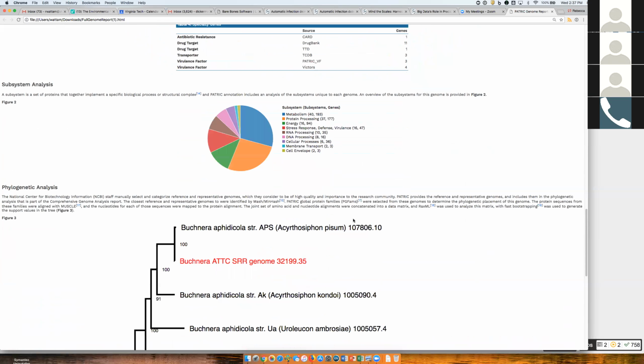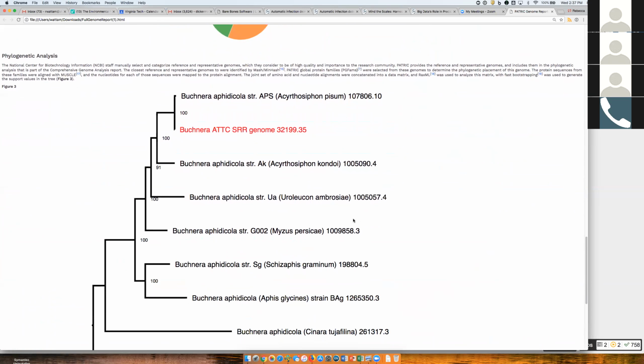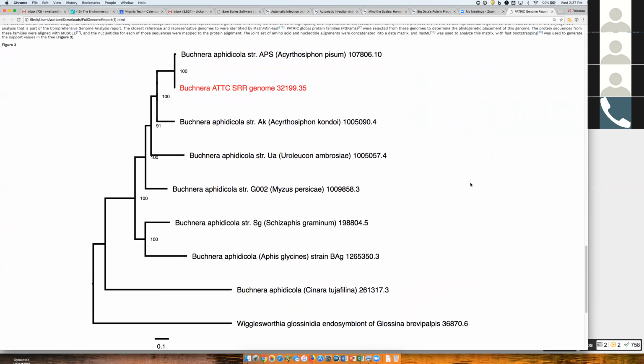So the next thing we do, and the final thing that we do in the report, is we build a quick tree. We use the similar genome finder, which does MASH min-hash, to try to find the closest relatives to your genome. And then we choose 10 close relatives and we try to step out one. So you see, try to find the nearest one. And this is a very fast approach for a tree. I wouldn't use this necessarily in a publication, although I like this.